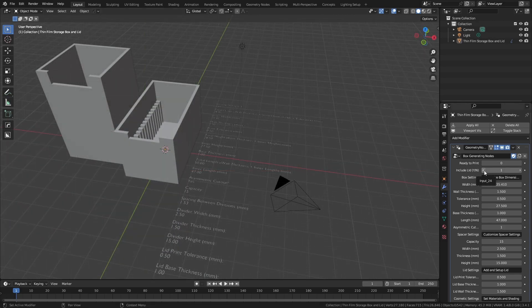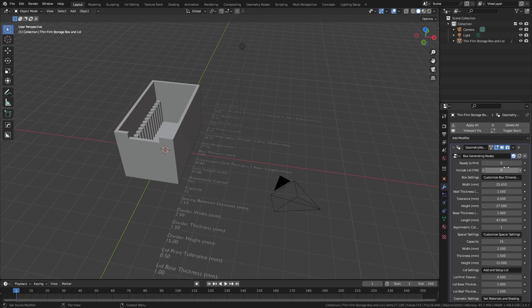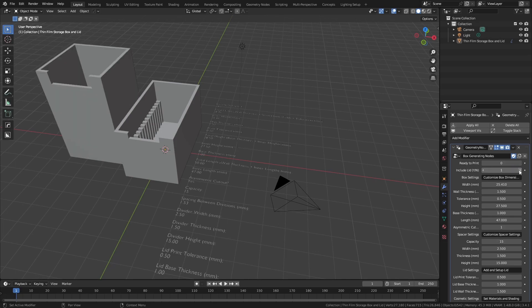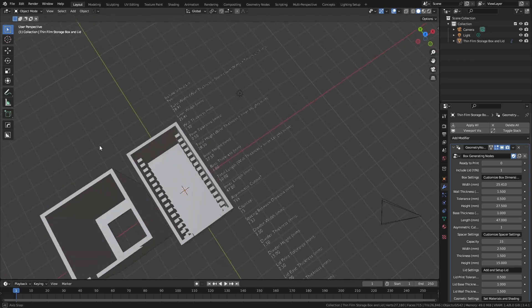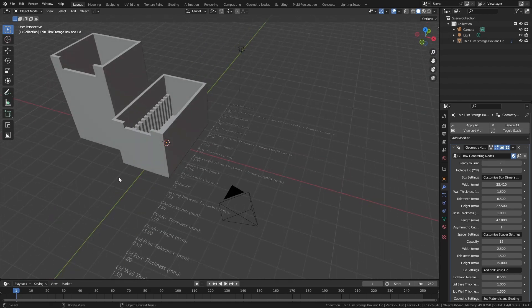There is also an option to add or remove a sliding lid with its own adjustable parameters that will be offset from the main box for better 3D printing. The sliding lid also has an asymmetric cutout and a cutout on the back to make it easier to work with in glove boxes.